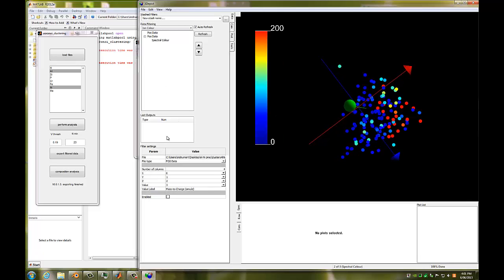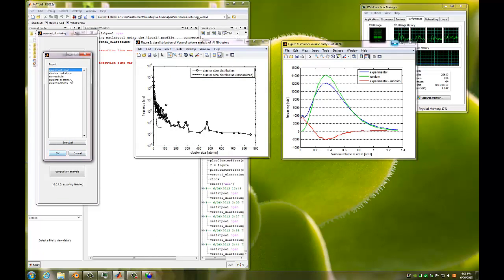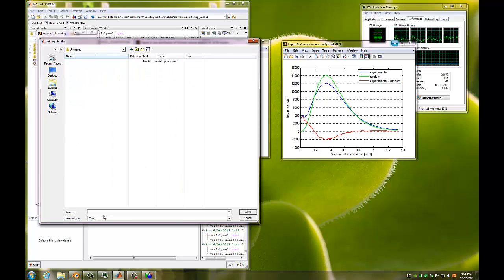So this is also a very, very helpful analysis. And I think 3D Pict is gone again, but that's what I wanted to show you in 3D Pict anyway. The next export is clusters, the convex hulls, which are really the envelopes of the clusters. So just select that, and we'll go to precipitates again and call that cluster hulls.